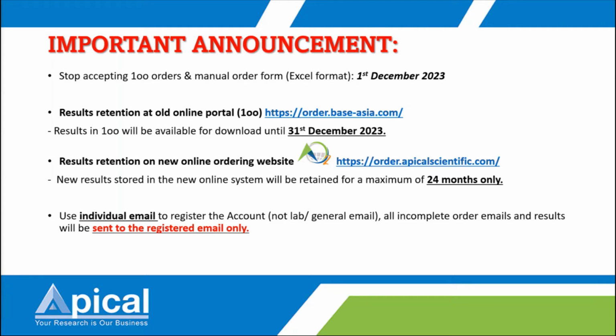And then the result retention on this new AO2 will be stored in the new online system for a maximum of 24 months or 2 years only. So yes, please download the results for this AO2 and then save them into your physical hard drive. So any special request on data retrieving, you can just email to us, same as what I told before.